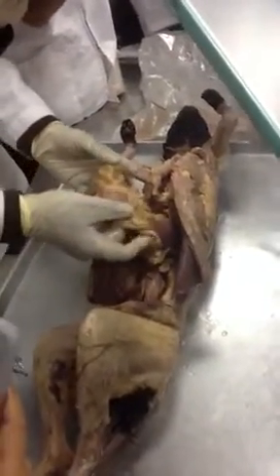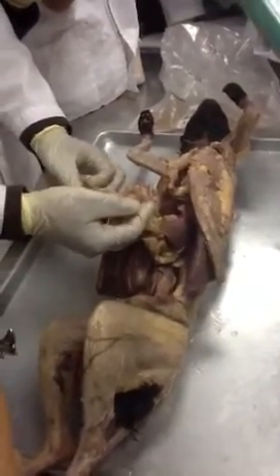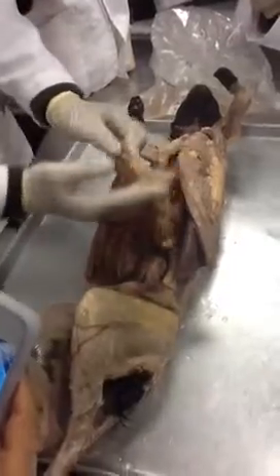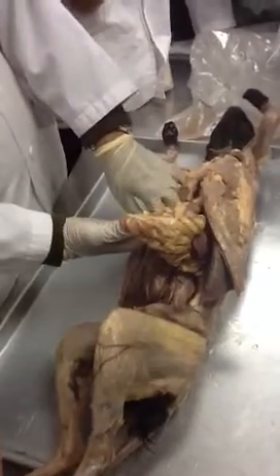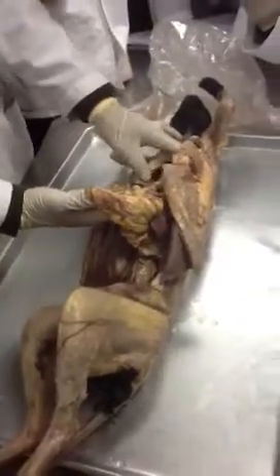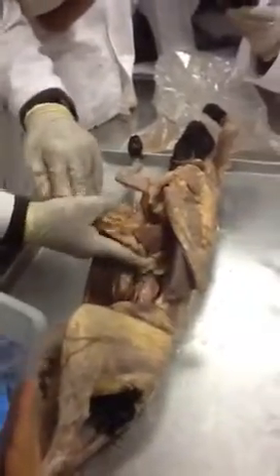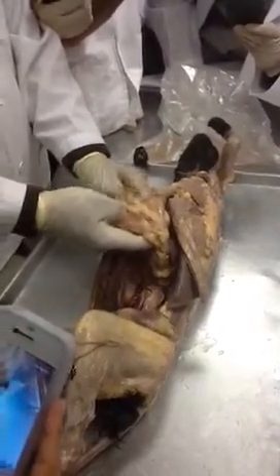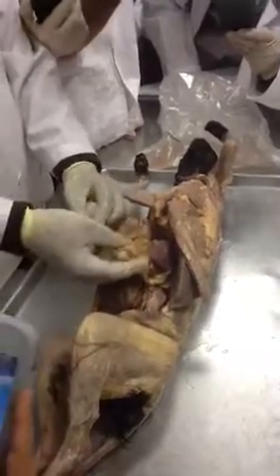Before we see the intestine, we see a thing like this. Do you remember the name of this thing? I said before the intestine. It's like a sac. It has got a name. Give us a clue. It starts with O. The greater omentum? Yeah, greater omentum.